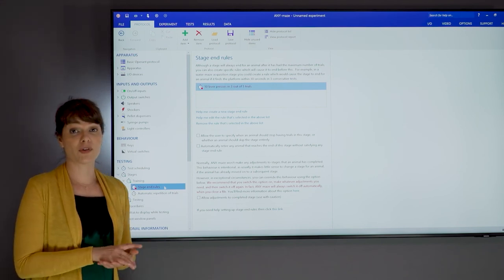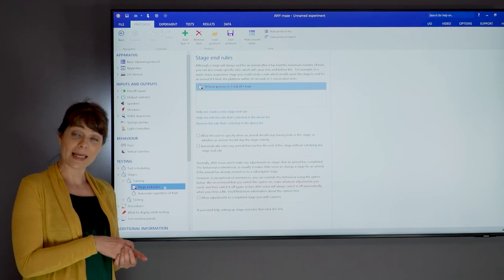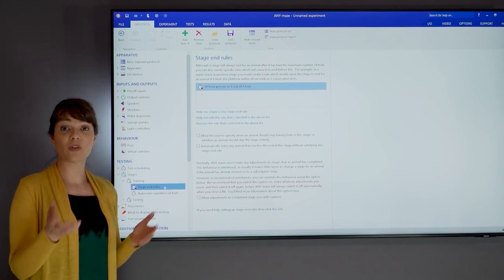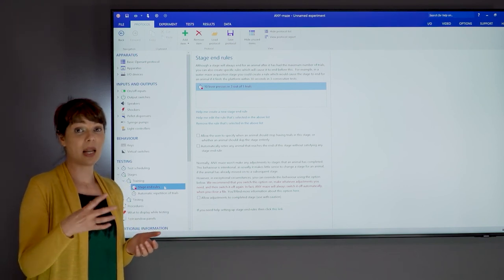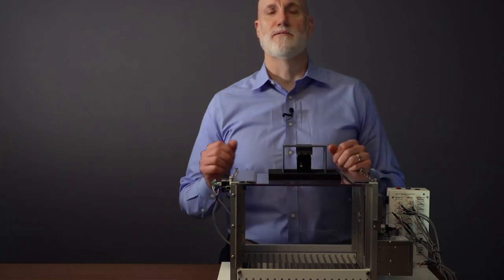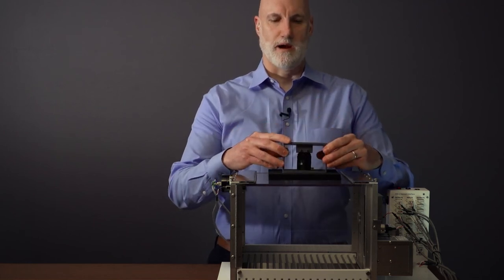Also, the authors assessed locomotor activity through photo beams. Anymaze could use photo beams, but alternatively, you could use video tracking. Video tracking is really easy to set up in an operant conditioning experiment. You can use the information not just to assess locomotor activity, but also within procedures, as you can, for example, make a light turn on if the animal accesses a certain part of the cage. Of course, if you're going to use video tracking, you're going to need to fit a camera to your system. And for that, we've designed a camera mount that can be easily removed and mounted back onto the cage.